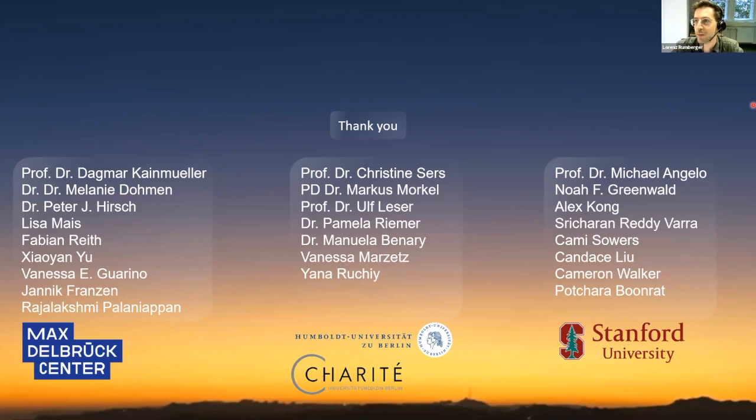And we hope that by this you can factor in this biological prior knowledge or these co-expression patterns that you know of. And the runtime of the model on my laptop GPU, I think I can do inference on 4 samples sized 1024 pixels squared in one step, which is like a second.